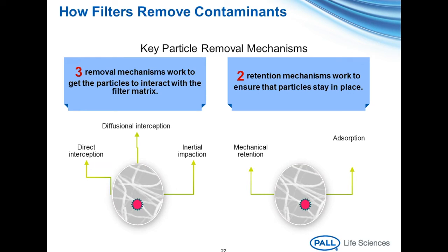During filtration, contaminants or particles in a fluid can repeatedly change direction to follow the tortuous pathways found in a filter matrix. As the fluid changes direction, inertial forces can cause particles or contaminants to impact on the filtration medium and be retained even though the particles and contaminants could be smaller than the rating of the filter membrane.